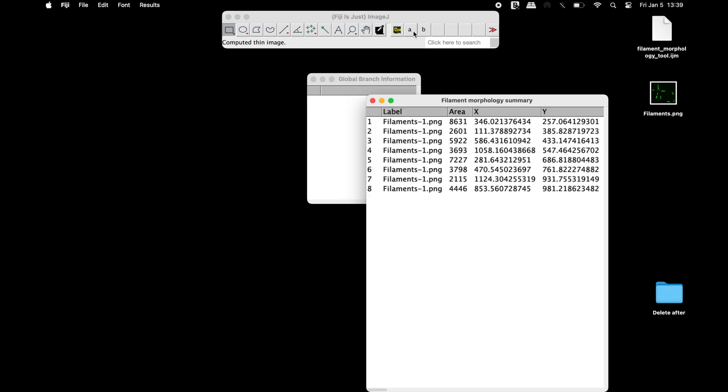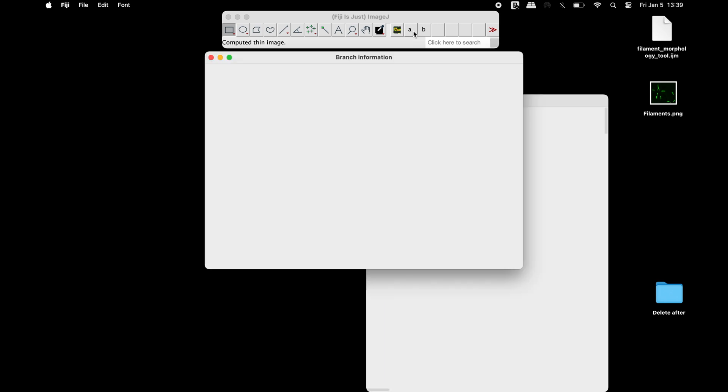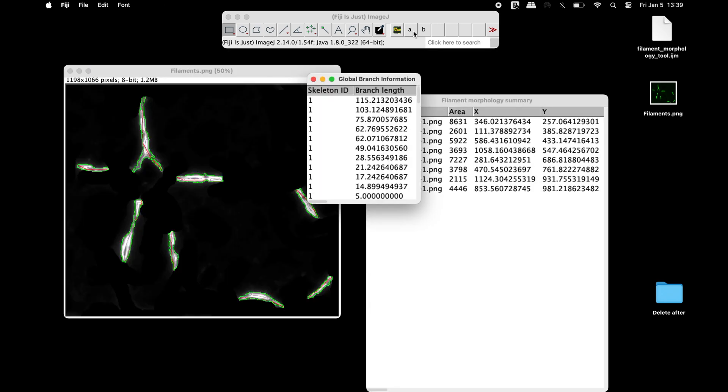Upon completion, the results are displayed in separate windows. The output image contains the filaments with outlines.